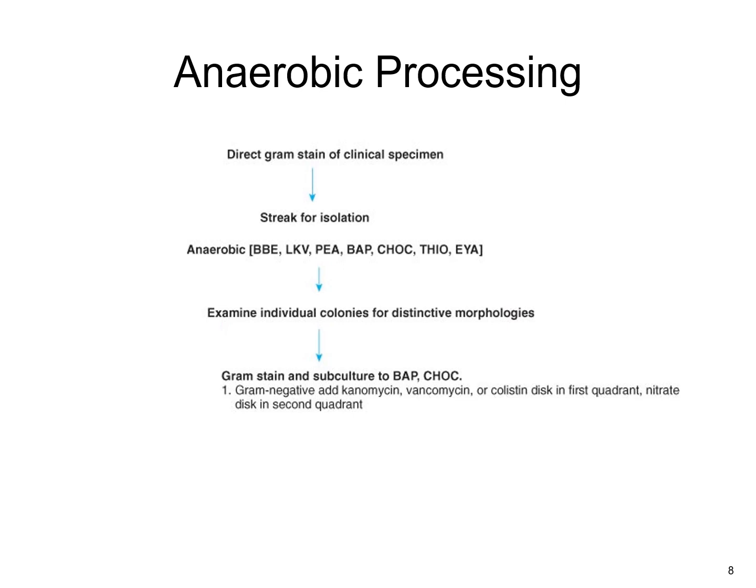So you would also set the cultures up, so you'd streak for isolation, and you would set it up on the anaerobic media. Each facility kind of picks which particular media they want to use, so they know which organisms are more common in their area, so they may base that on what their area presents with. And then after you've set that culture up and let it incubate, usually 48 hours, then you would examine those anaerobic cultures. But typically when you set up an anaerobic, you're also going to do an aerobic, so those would be reviewed the next day.